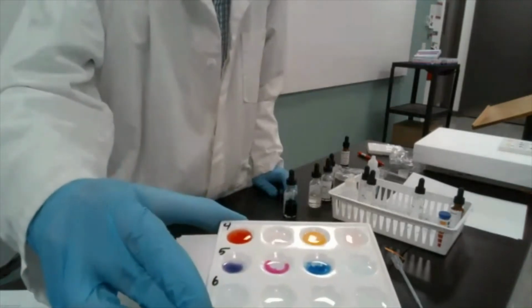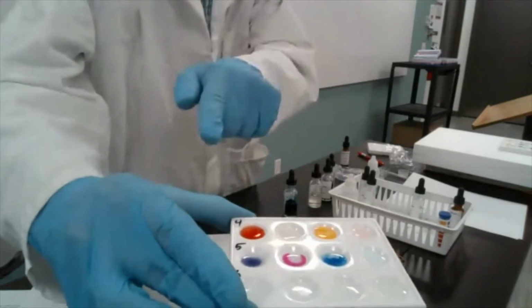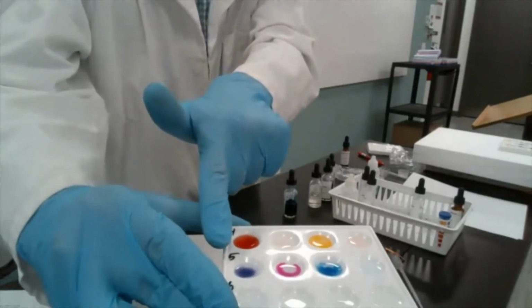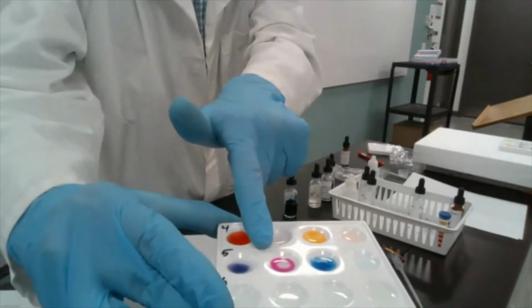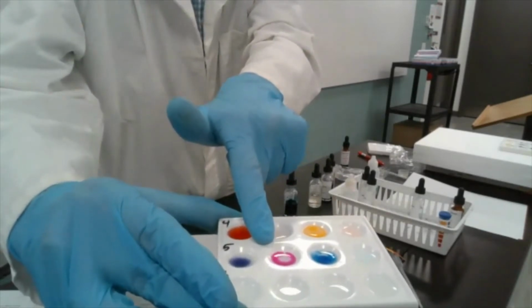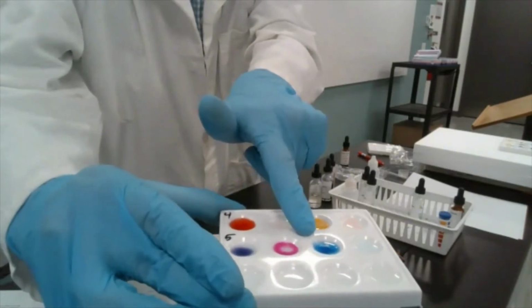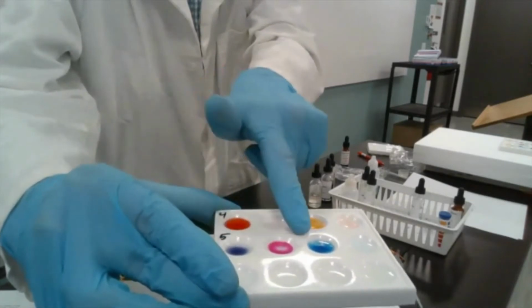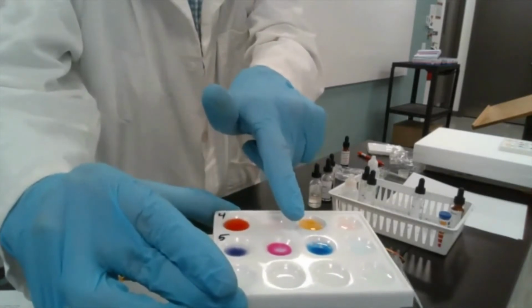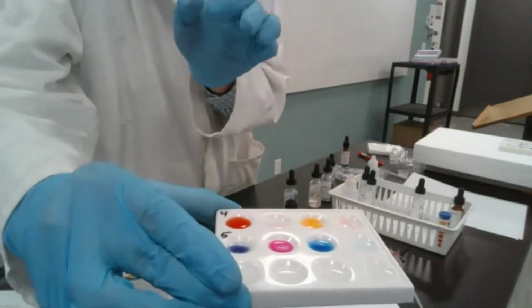So let's look at what we have here color-wise. You see that where I added the indicators, we have blue here with the bromothymol blue. We have pink color developing with phenolphthalein, and we also have blue with the litmus. So both blue litmus and bromothymol blue give us a blue color when mixed with ammonia or glass cleaner.